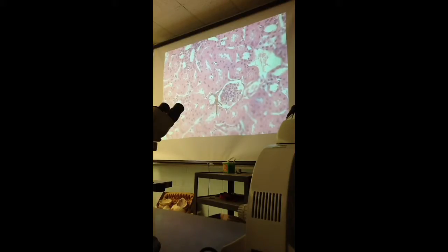These cells that are close to the glomerulus are darkly stained, and on the other side they are relatively pale. So these darkly stained cells are the macula densa. That's the reason they are called macula densa, densely stained on histology. And if you happen to see an afferent arteriole, roughly there we might be seeing the juxtaglomerular cells, but that's not that. So this tubule, proximal or distal?